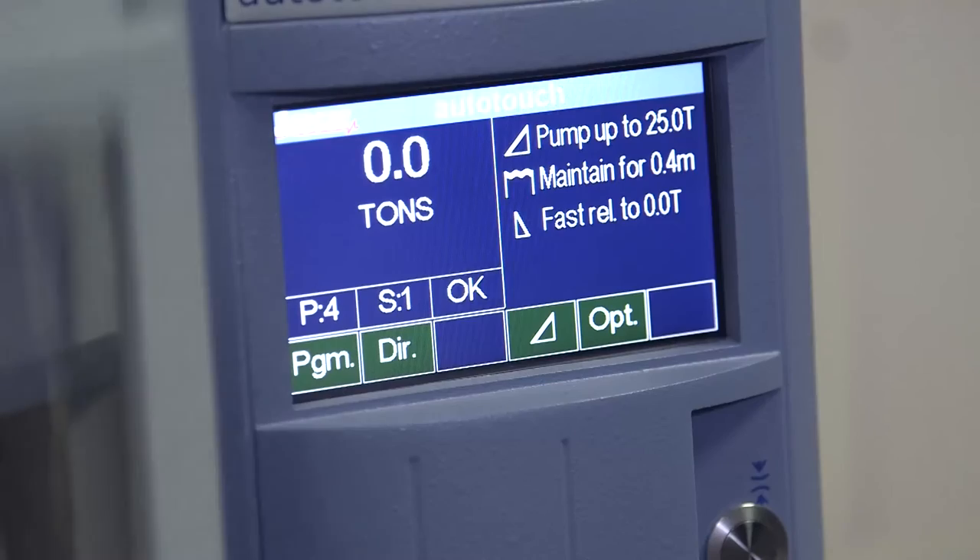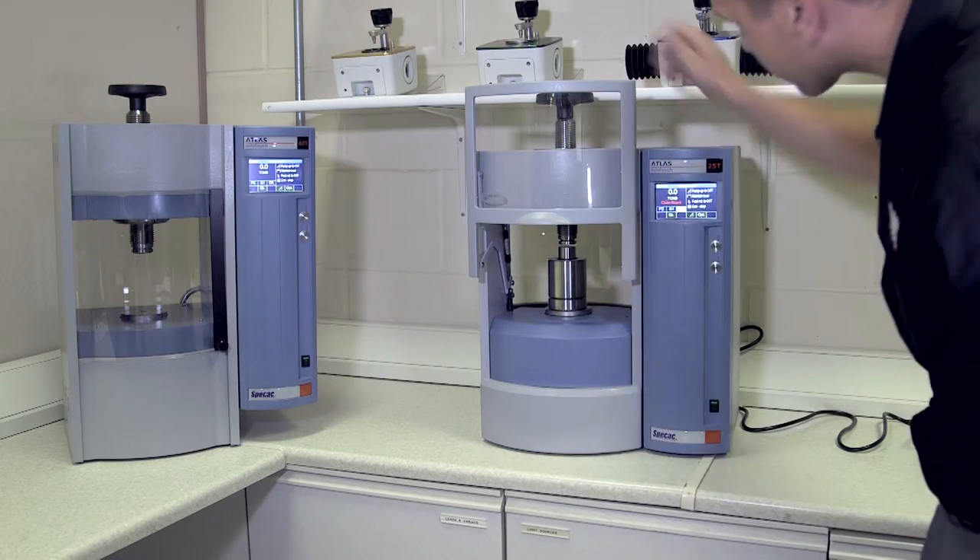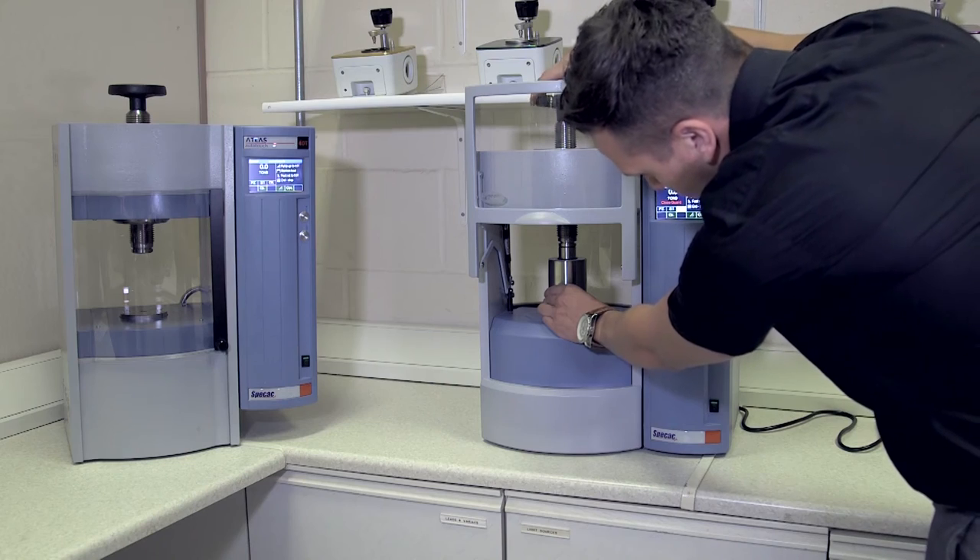All of the Autotouch presses are supplied custom-built with safety guards. While that guard is open or lifted and the closed guard message is still on the screen, you can't actually use the press. The benefit of the safety guard mechanism is that it completely removes the risk to the user.